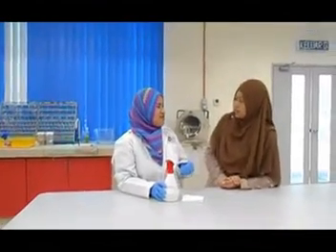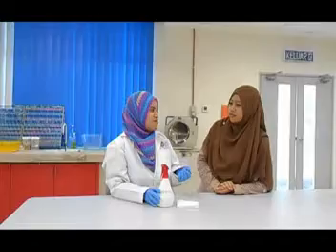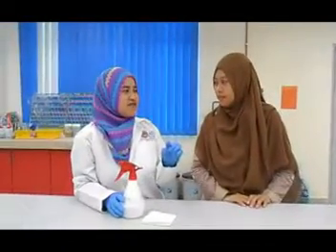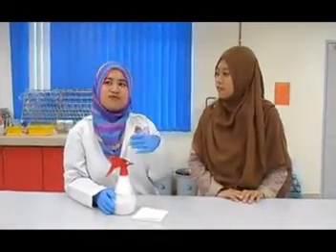Are you wondering what apparatus cannot be sterilized by using heat sterilization? Yeah, of course, because it's kind of special, right? It's quite special actually. Yeah. Well, as you are aware, electronic components or plastic packaging and plastic container are quite sensitive to heat, so we cannot use heat to sterilize the instruments.